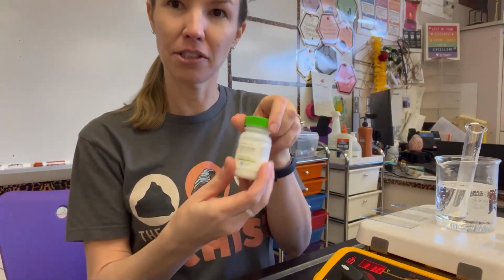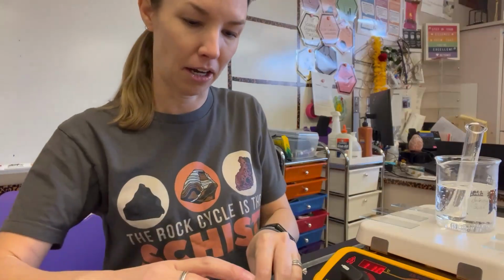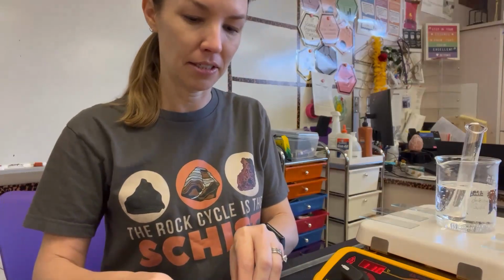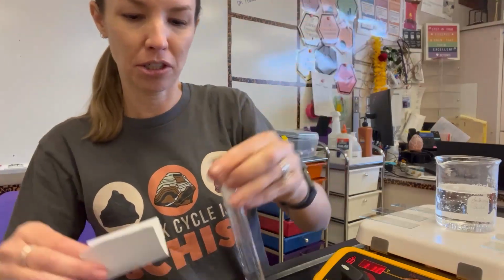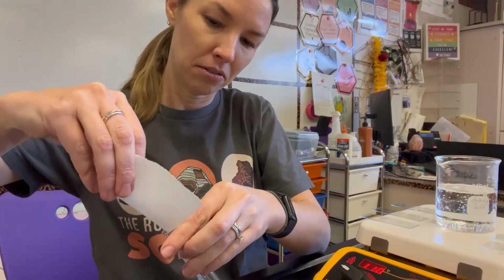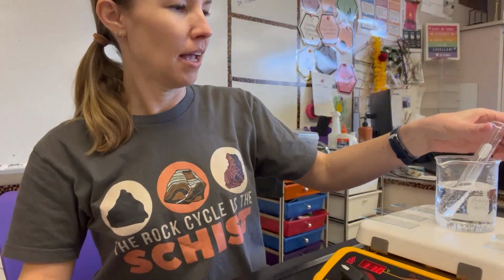First thing you're going to do is take some of this, which at room temperature is in crystal powdered form, and I am going to put it into a test tube in my warm water bath. You'll see I already had a little bit in there, that at pretty low temperatures will turn into a liquid. So I'm going to let that warm up a little bit.